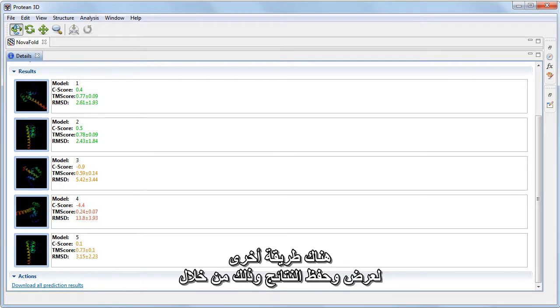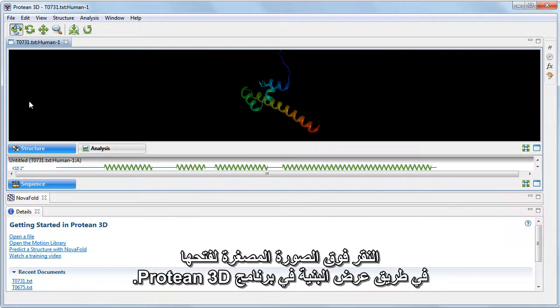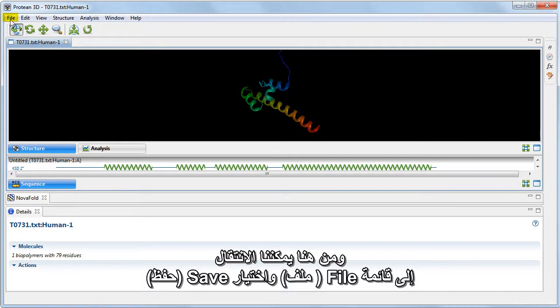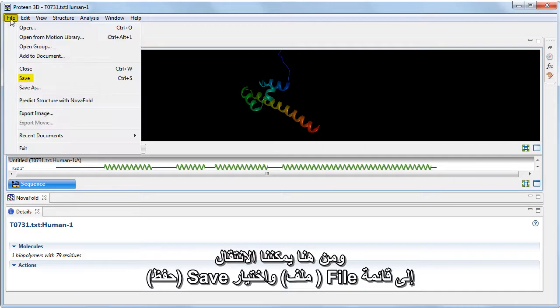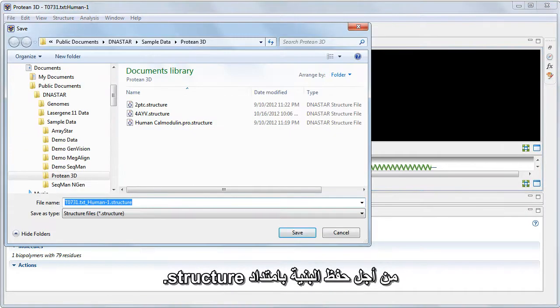Another way to both view and save the results is to click on the thumbnail to open it in Protean 3D Structure view. From here, we can go to the File menu and choose Save to save the structure as a .structure file.